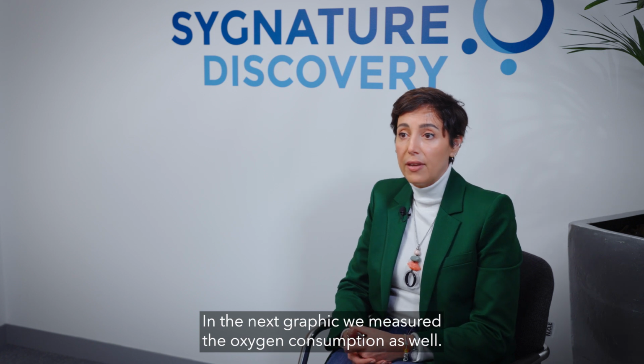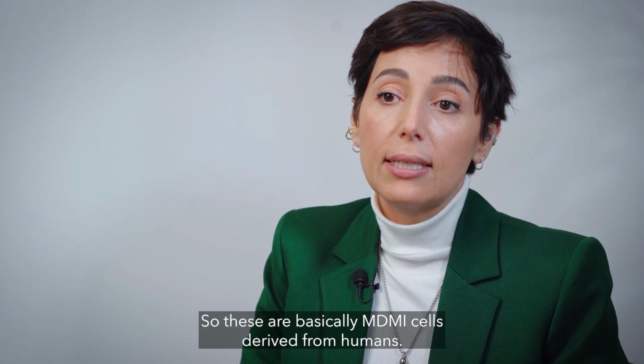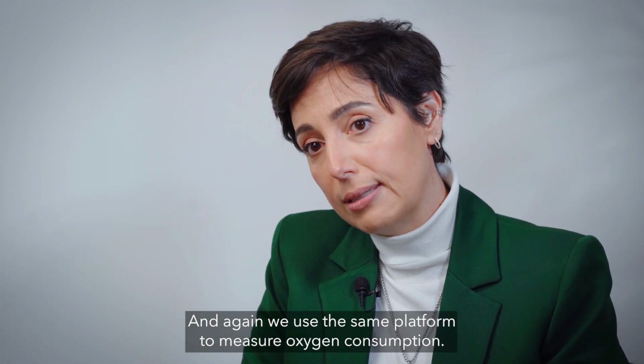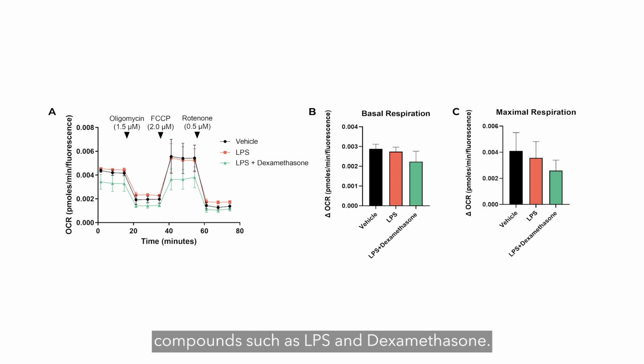In the next graphic, we measure the oxygen consumption as well, but using MDMI cells, which are derived from humans. Again, we use the same platform to measure oxygen consumption. In this experiment, cells were exposed to different compounds such as LPS and dexamethasone.